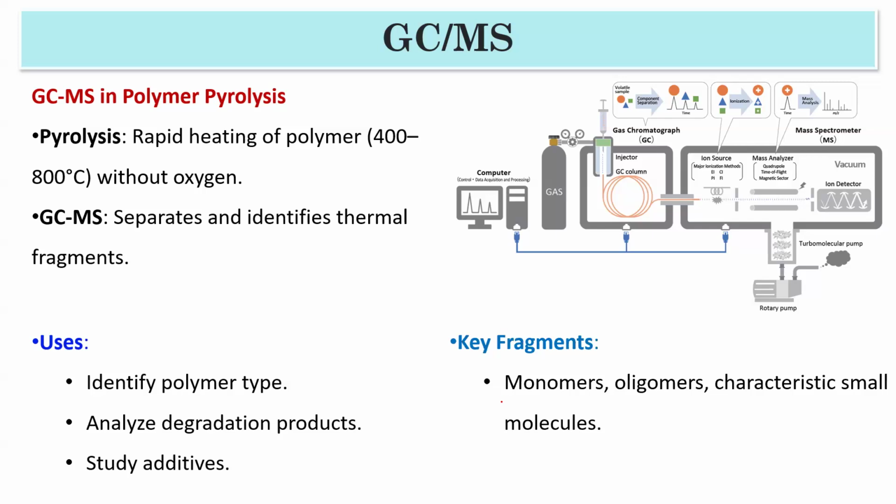So the best thing is you can do it for monomers, oligomers, and other small molecules. But please understand, you cannot use GC directly for polymers.